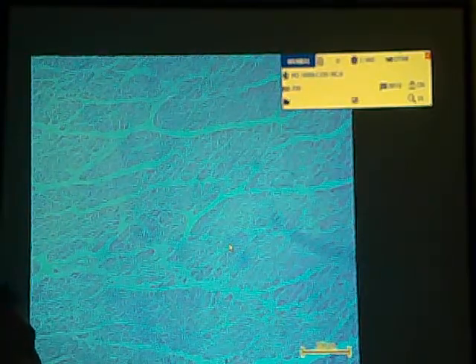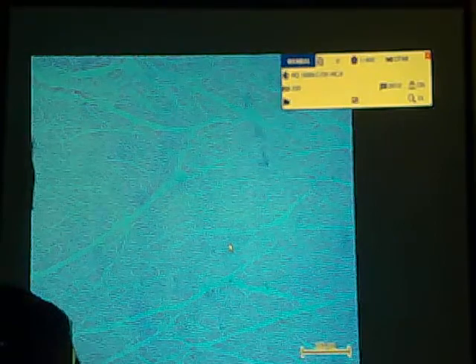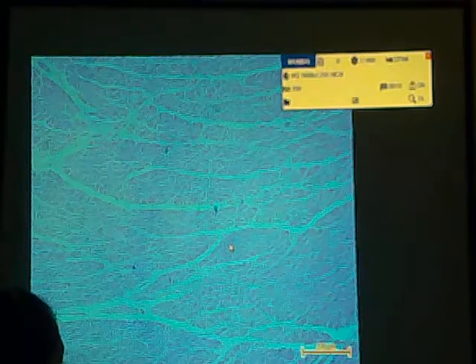Of course, when you say hypertrophic, enlarged, but in reference to a point. In reference to another, of course, I have to compare it with the normal. So, it is clear. You will be able to identify what is normal from the abnormal. So, you should be able to identify which one is the hypertrophic heart. Right? Because it is difficult to identify the hypertrophic myofibers here, unless you want to look for enlarged muscle fibers. But it is really difficult to find it here.